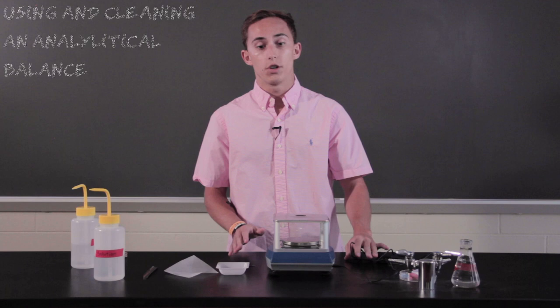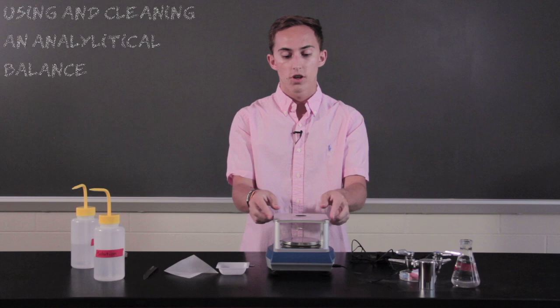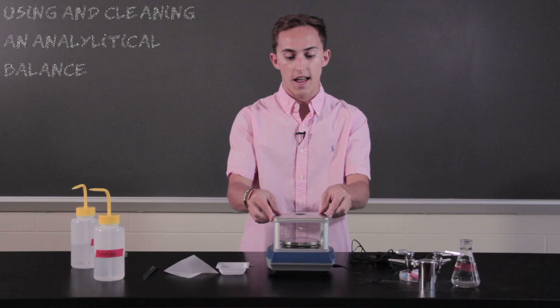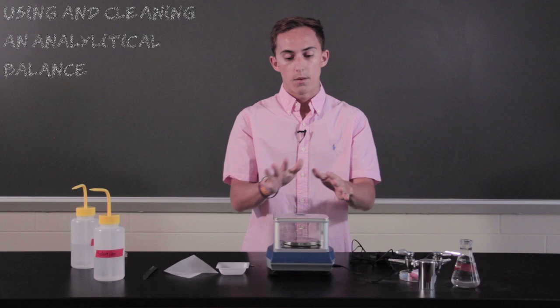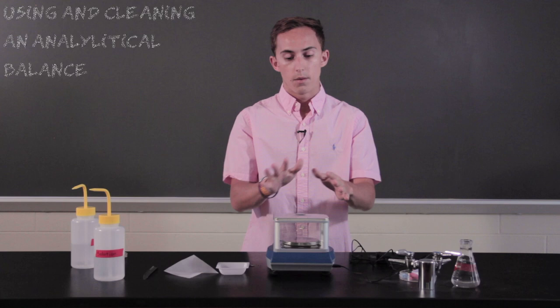So another way in which you can clean it, is to take a brush, like a small brush, and just wipe down the inside. That is for an analytical balance that has sliding doors. You can take back and forth, and then you can sweep it out. But for this one in particular, what we're allowed to do is we can wipe it down with alcohol, and it will capture all the particles that we need, and that is it.